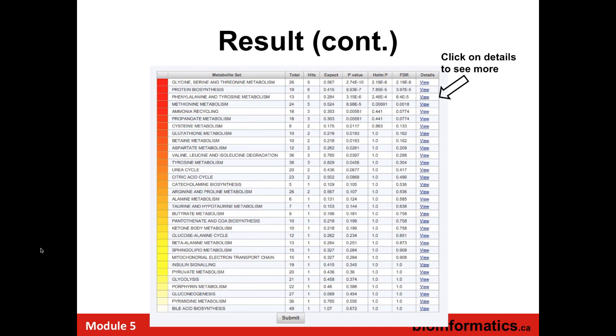So if we use the FDR, where is the cutoff? Again, it's sort of arbitrary, but most people use an FDR of 0.05. But you can use an alpha value of 0.01. You could use an alpha value of 0.1. You just need to explain why you've chosen that. I saw in gene enrichment analysis, they use 0.25. 0.25? Yeah. I guess if you want to do that.